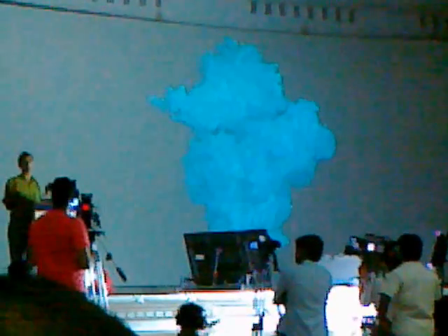So when you finish this experiment, and you've done it correctly, what you end up with is a three-dimensional image of the object you're looking at. And in our particular case, originally it was the 30S subunit of the ribosome. And this is what it looks like. Of course, the problem is this doesn't tell you what the atomic structure is. This is simply a three-dimensional image of the object, although in much greater detail than you would see otherwise.